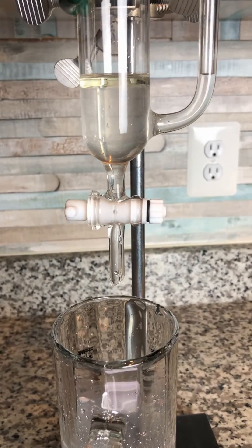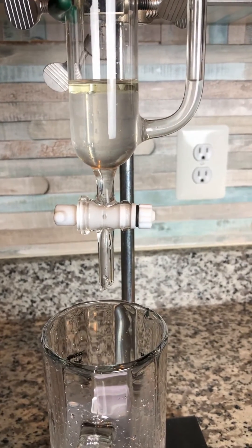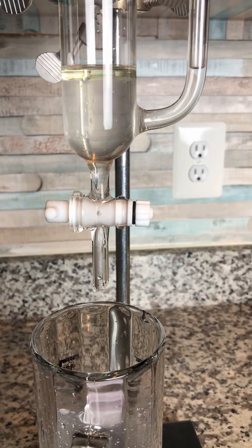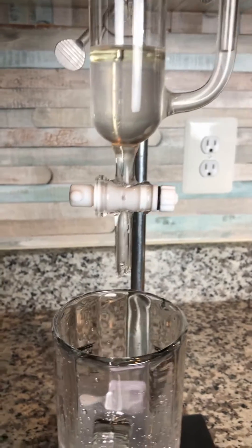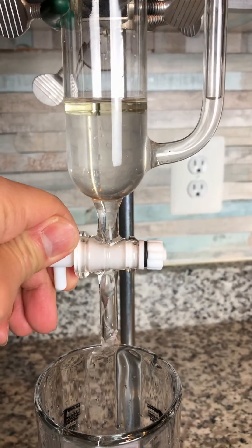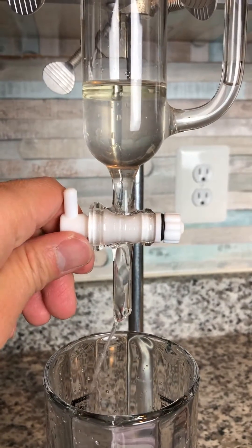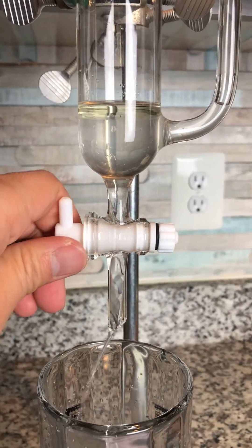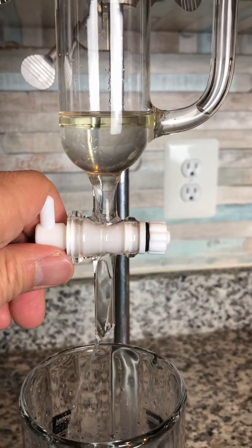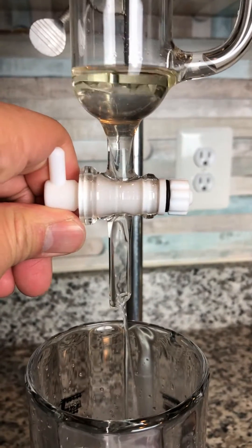When you're using the separator, you want to drain the hydrosol first, and before the essential oil comes down, you close the valve slowly. You can see the oil is getting closer to the bottom, and when it reaches the neck, you close it.